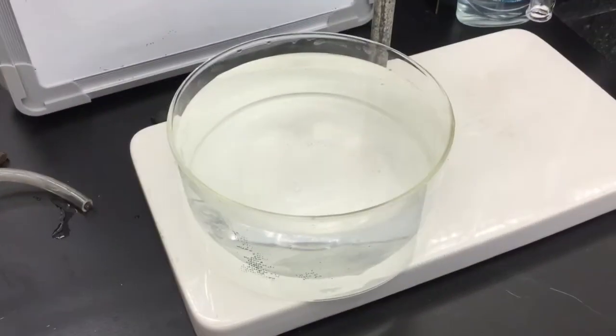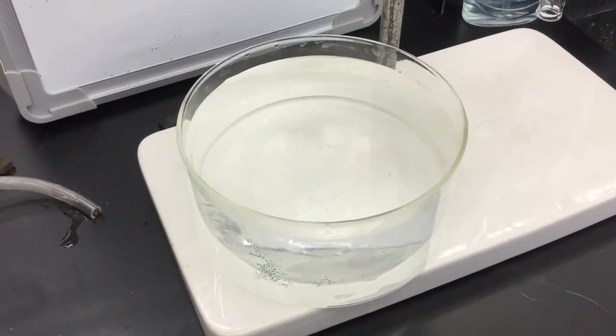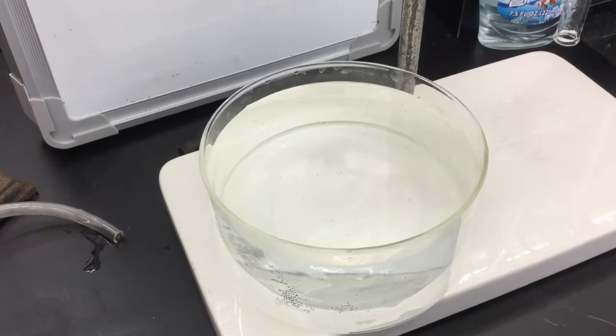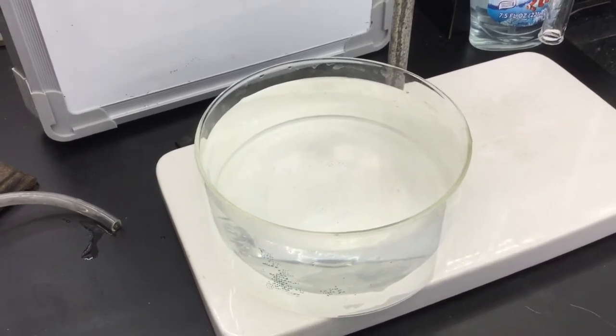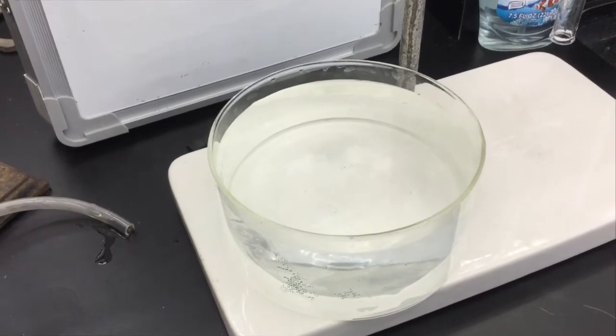If it does not already have water in it, fill your crystallization dish about 3/4 to 7/8 full of water, so that you will have plenty of water for the displacement of the gas.